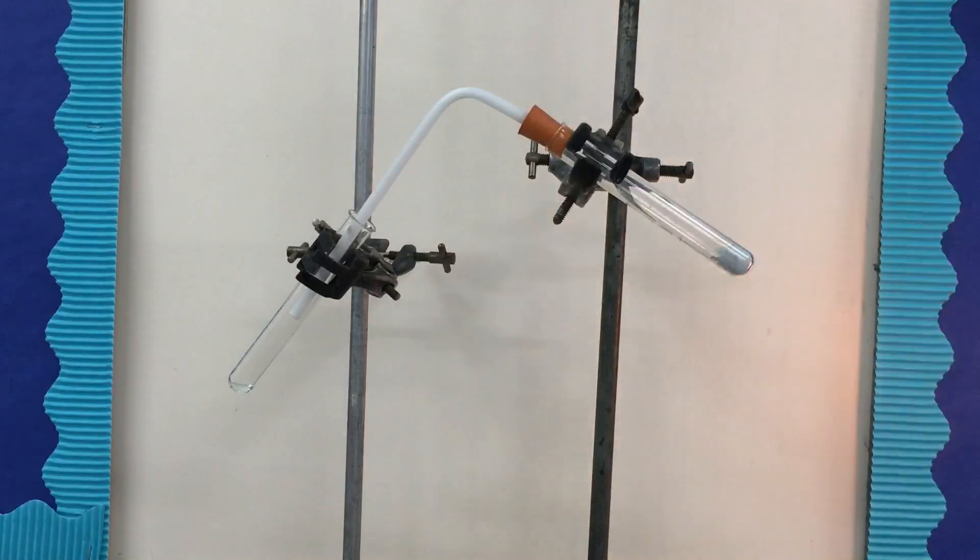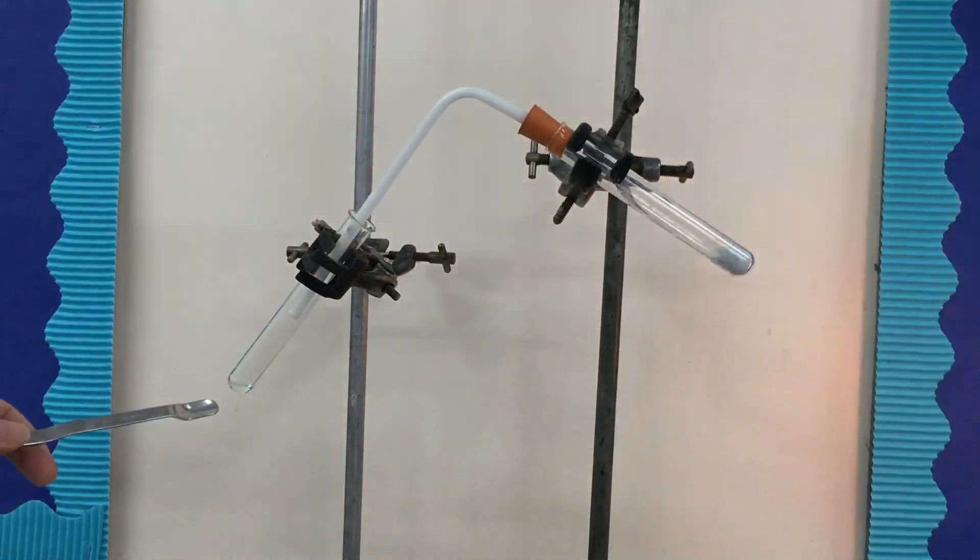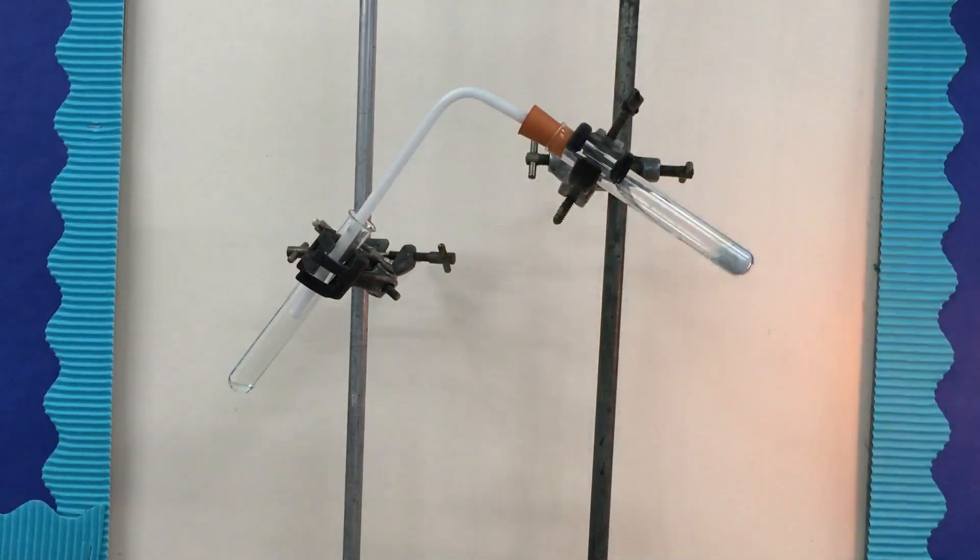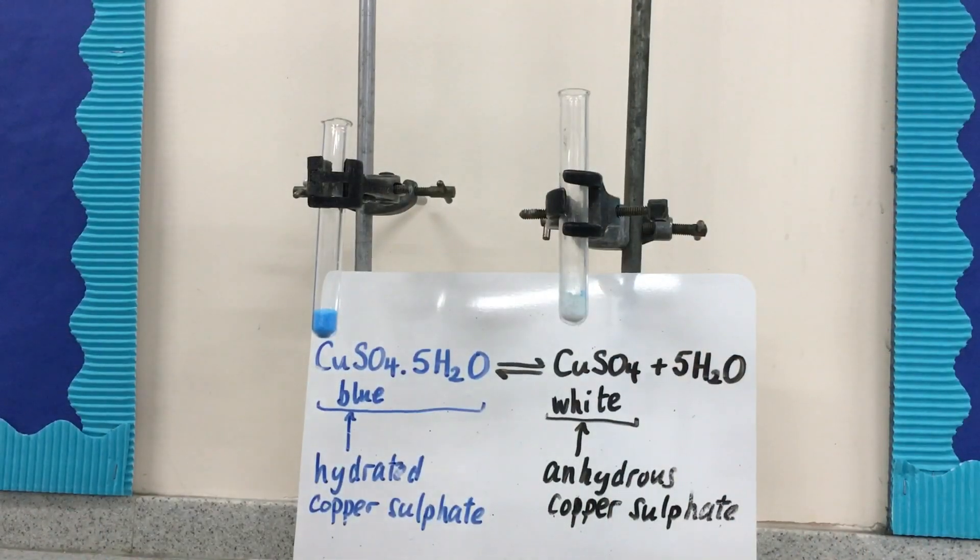We've heated the originally blue hydrated copper sulfate, CuSO4·5H2O, and it's become the white anhydrous copper sulfate, and water which we've collected in that tube there.